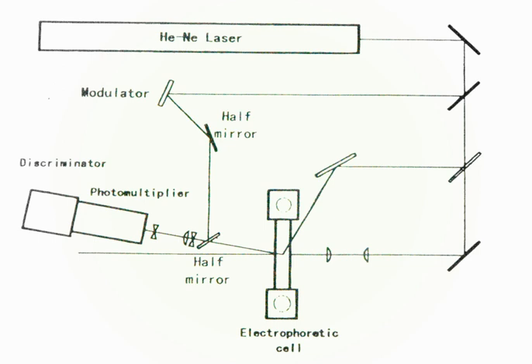In a fringe optics ELS instrument, a laser beam is divided into two beams. Those cross inside the electrophoresis cell at a fixed angle to produce a fringe pattern. The scattered light from the particles, which migrate inside the fringe, is intensity modulated. The frequency shifts from both types of optics obey the same equations. The observed spectra resemble each other.